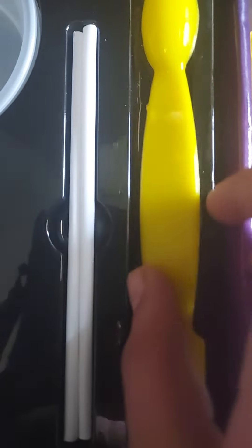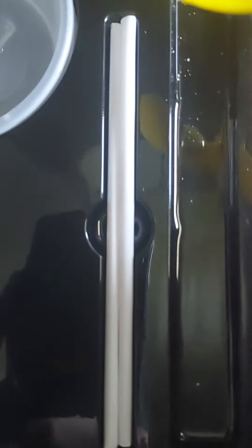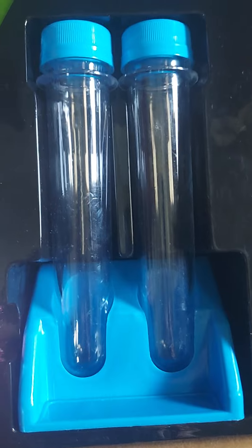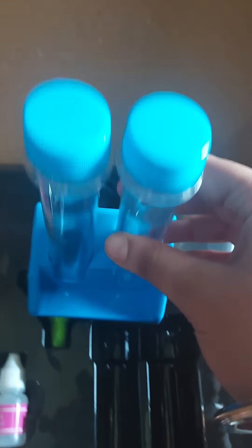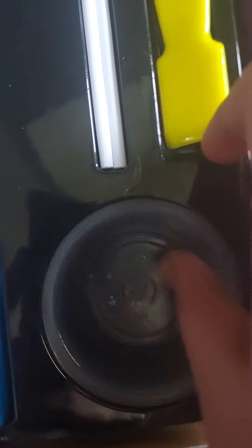Here is a measuring scoop — so when the booklet says 'pour one scoop of baking soda or crystal powder,' you use this. There are also stirring sticks included. And here are two test tubes, which are big and will be used in many experiments. Finally, there are also two small bowls in addition to the larger ones.